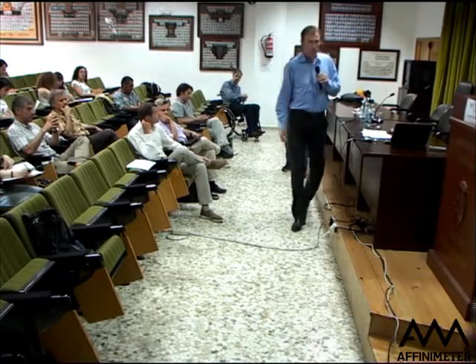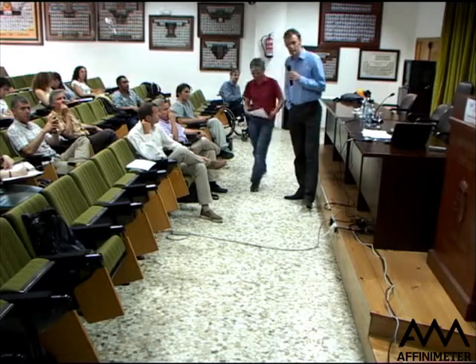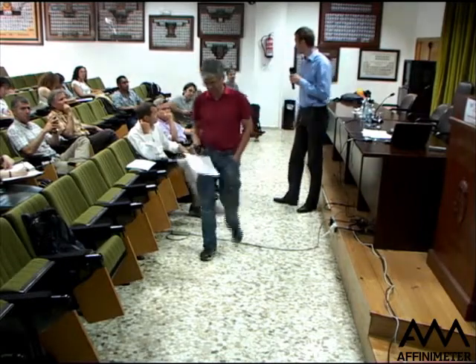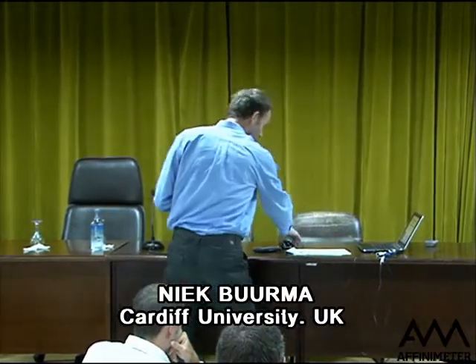Thank you for the introduction, and thank you for the invitation to present our work here today. And finally, thank you to several of the previous speakers for introducing a lot of very important concepts in isothermal titration calorimetry. So what I'm going to assume is that everyone follows Natalia's advice and that everyone has good data, and we're going to have a look at how you can analyze that data on the assumption that your data is good in the first place.